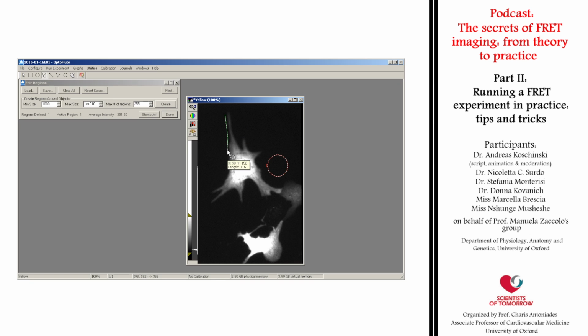As long as you have a decent signal-to-noise ratio, and you are only interested to see the whole cell cAMP change, you can create the area quite roughly. This has the advantage that even if the cell would move or change their morphology a bit, it wouldn't leave the ROI. And as the background will be later subtracted, it will not influence your measurement significantly.